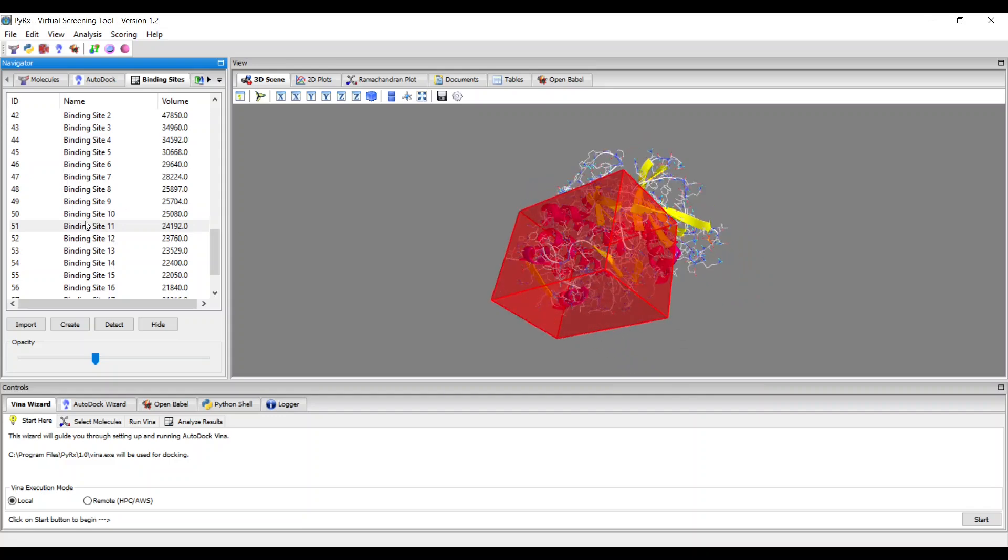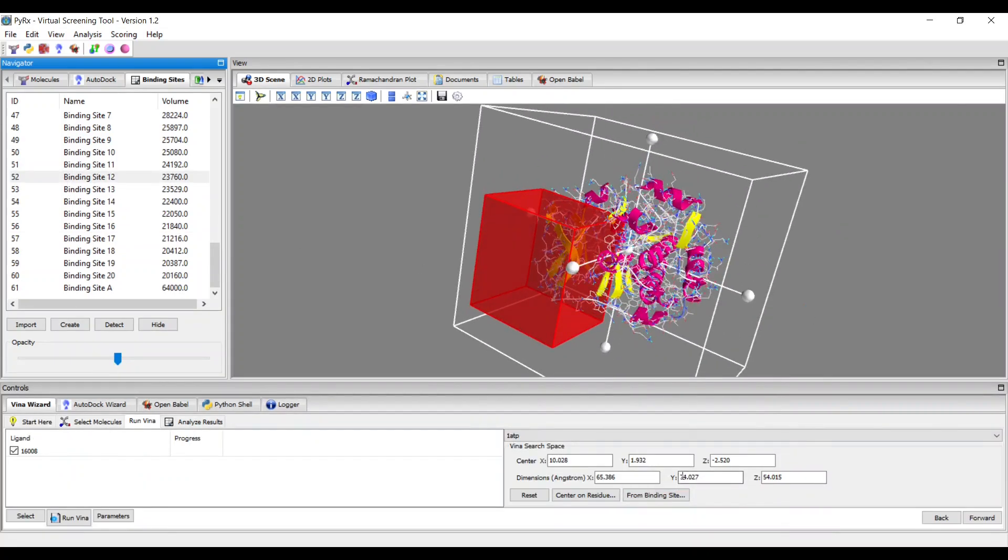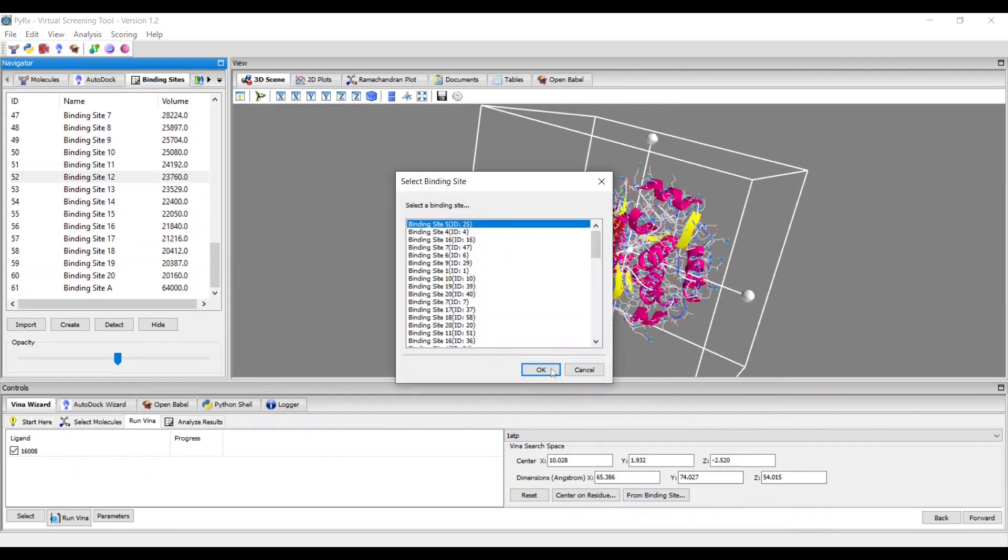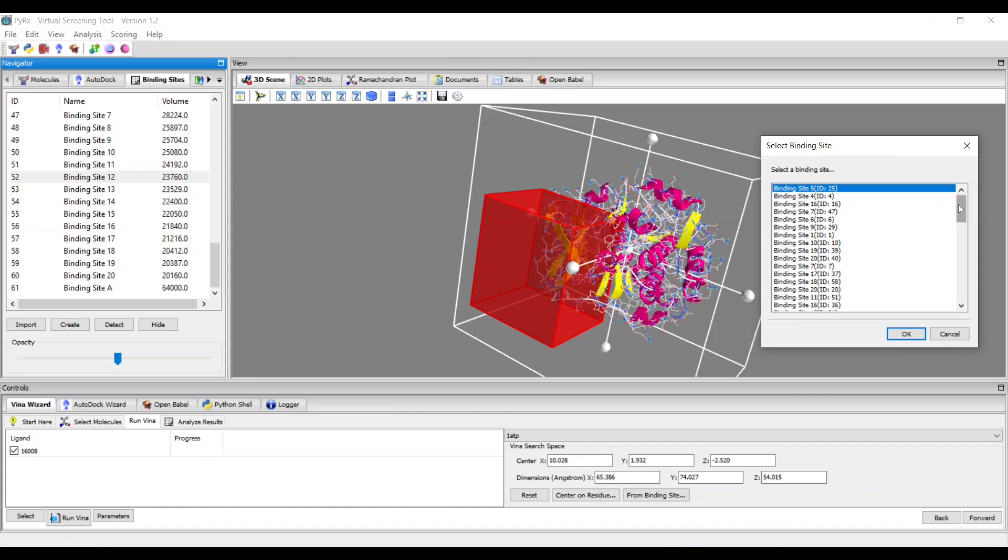The binding sites can be directly used with AutoDoc Vena when setting up the docking grid box in the docking process.